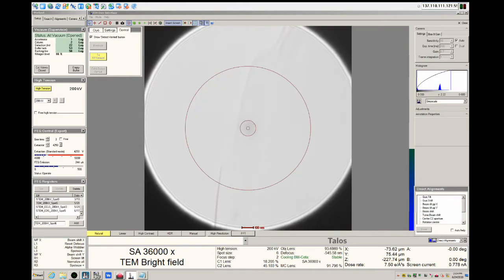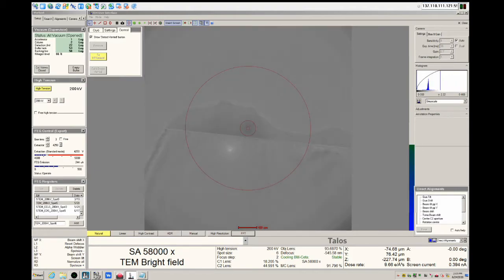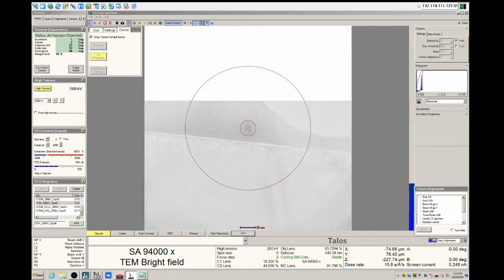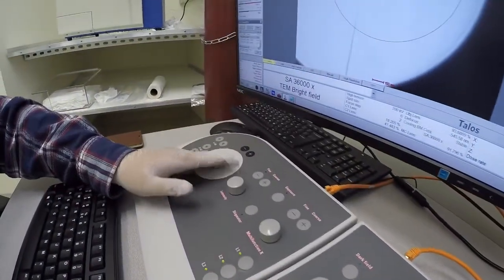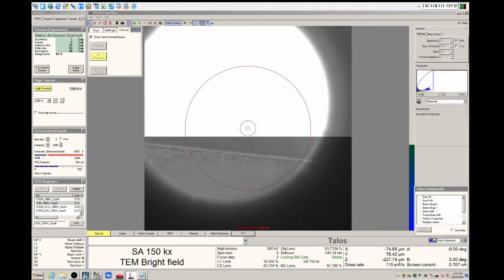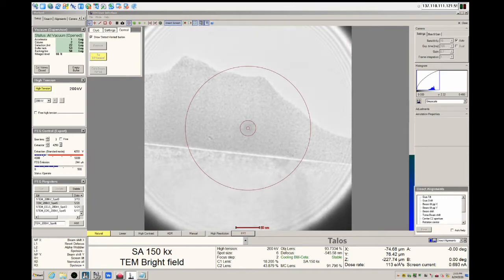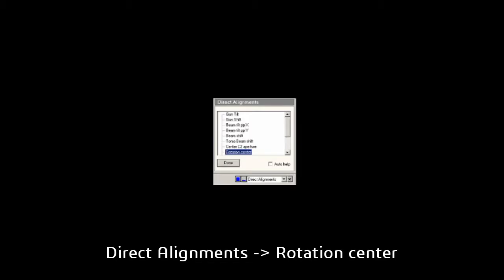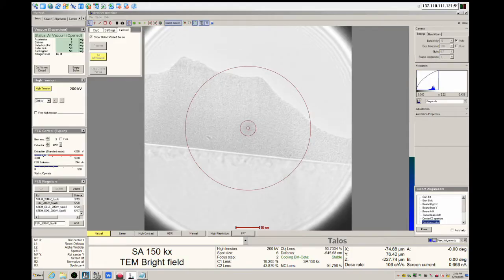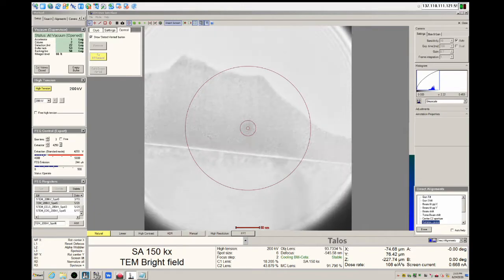The next set of alignments can be performed on the sample, so we're going to navigate using the joystick onto an amorphous area of our TEM lamella. At this stage, we should increase the magnification again by adjusting the magnification and intensity dial simultaneously. Should the electron beam need subtly adjusted, you can use the trackball to move it. Take care not to do this too often though, because we don't want to upset the underlying alignments. Next alignment is direct alignments rotation center. This will modulate the beam. The goal is to use the MFX and MFY dials to minimize the image motion. The example showing on the screen is good alignment.